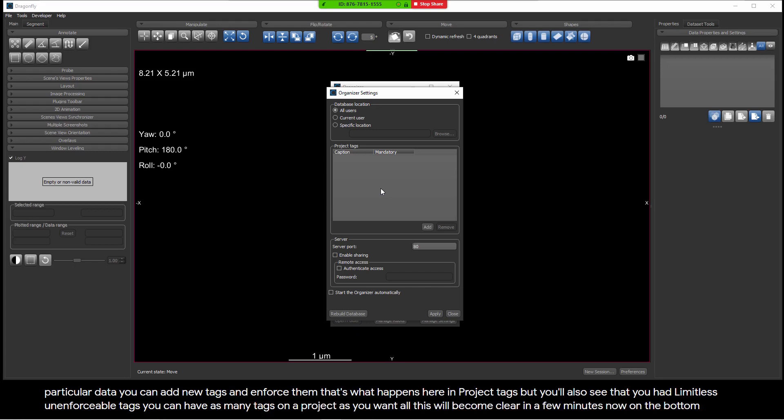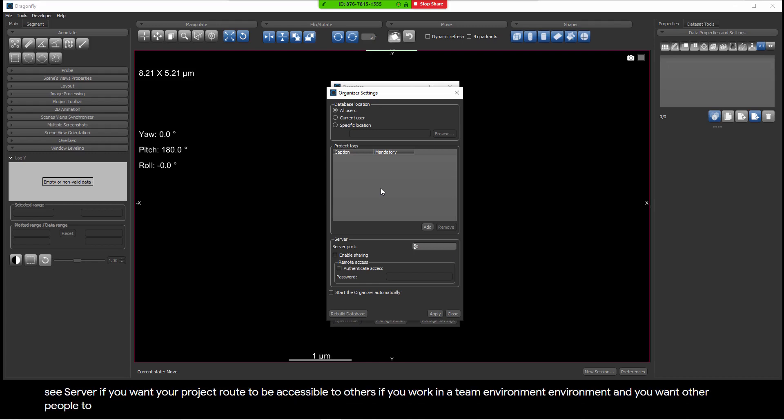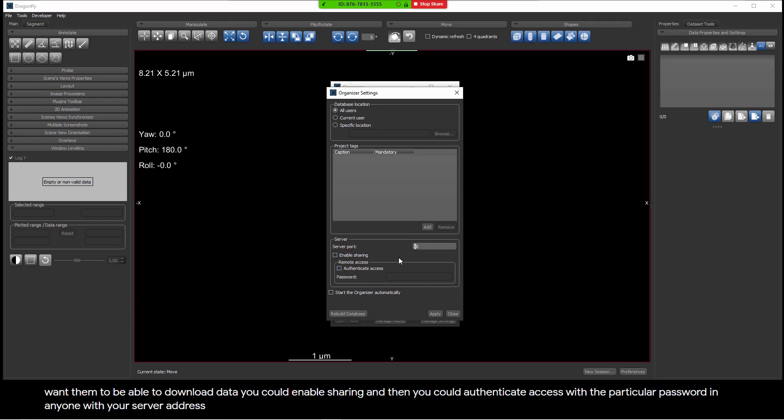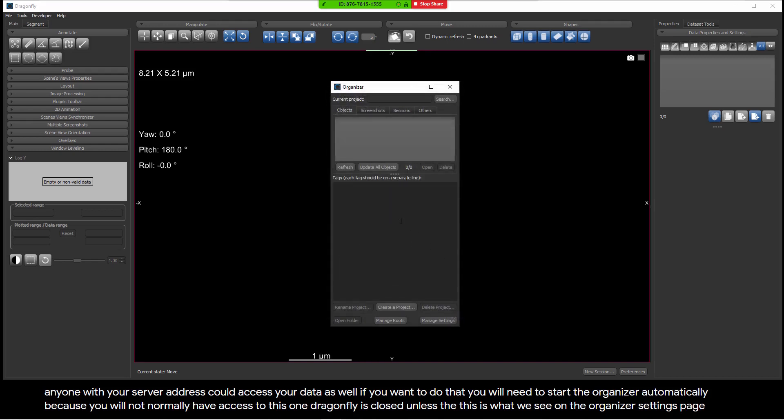On the bottom, you see server. If you want your project route to be accessible to others, if you work in a team environment, and you want other people to be able to view and download data from your projects, they will not be able to overwrite or change data. But if you want them to be able to download data, you could enable sharing, and then you could authenticate access with a particular password. Then anyone with your server address could access your data as well. If you want to do that, you will need to start the organizer automatically, because you will not normally have access to this when Dragonfly is closed, unless the organizer is running in the background.